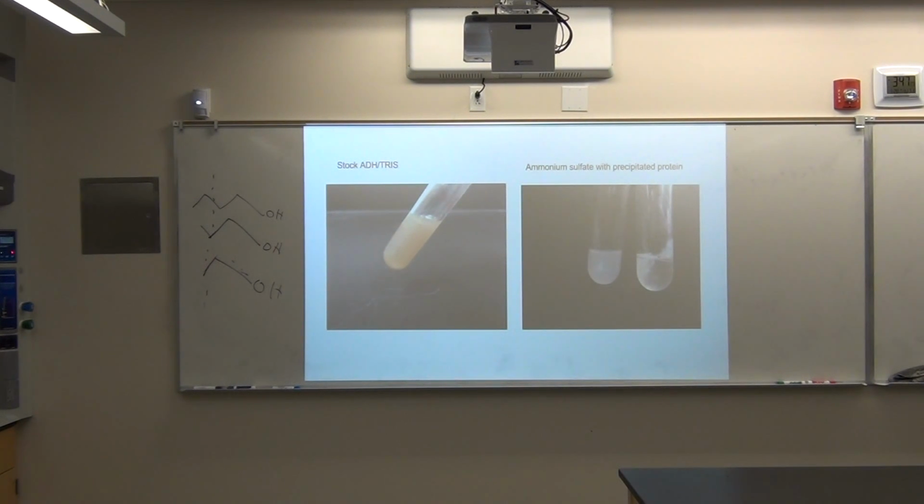That's intriguing. One of the things that we determined was that the NAD was being reduced to NADH, most likely through its normal processes, because the yeast was still alive and reproducing itself. So just the normal citric acid cycles, there's 3 or 4 enzymes that reduce NAD to NADH on its own. So we had to ensure that we had no yeast every single day, so that took a lot of time. I mean, you can get yeast just from the air, and that's challenging. We never saw that with the chemical lysis, the other method.